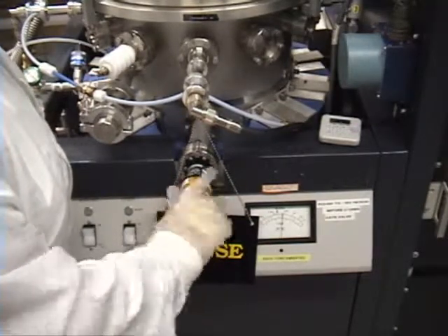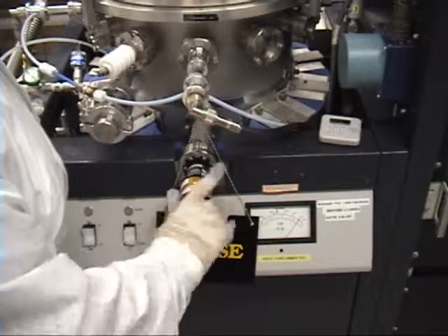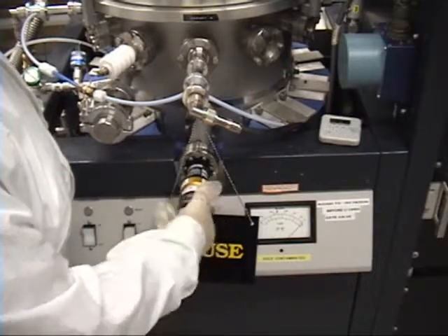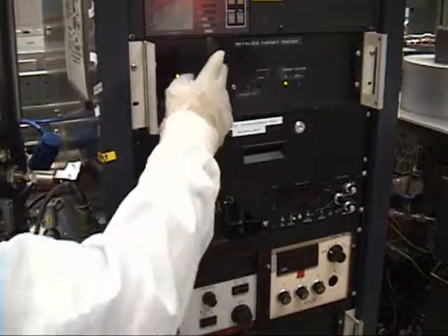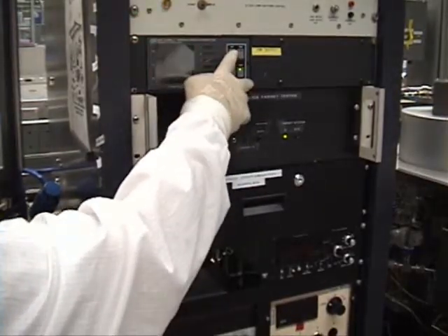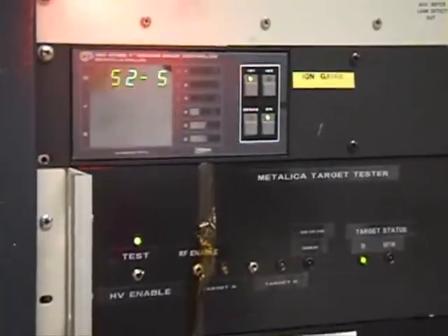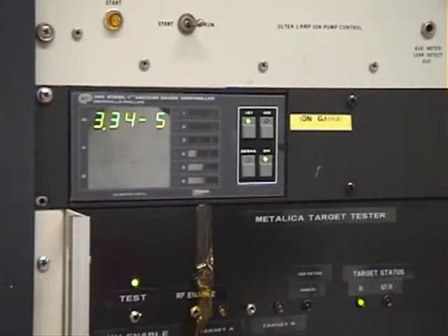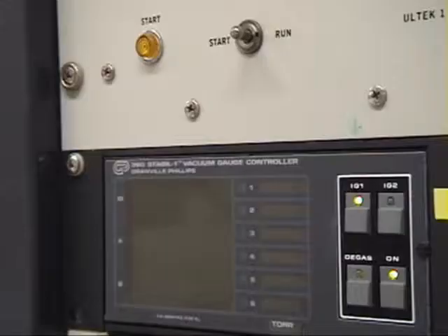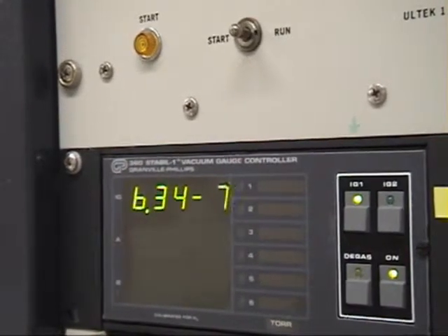You're going to open this valve all the way until you cannot open it any further — please do not force it. Now we're going to press the on button on the ion gauge. This on button is also your off button when we end up turning it off. You're going to use IG1 for ion gauge one. You get your digital readout. You're going to wait until it reaches 1×10⁻⁶, and this takes approximately one hour.